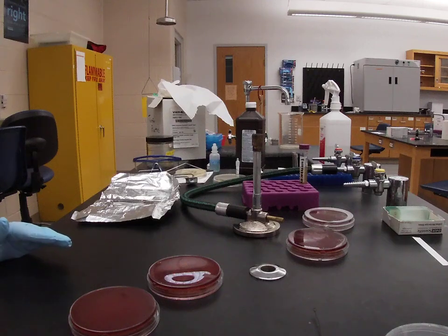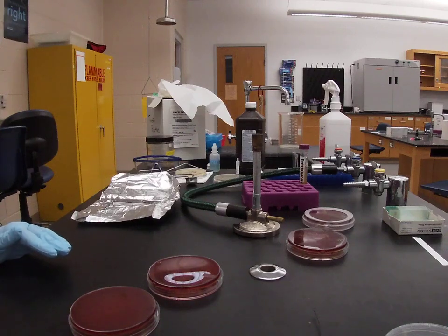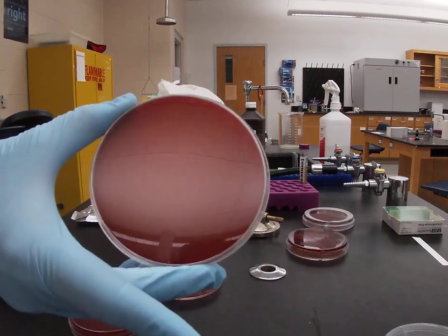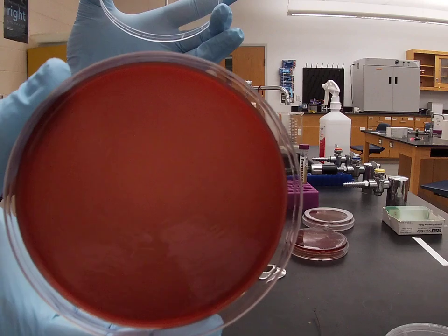Tryptic soy is a general purpose supportive medium that has lots of different nutrients in there that most things can grow on, but it's enriched with that 5% sheep's blood in order to make it a better environment for really fastidious organisms, like the streps. The streps grow really well on blood agar. So blood agar is an opaque red plate. It is very red and you cannot see through it under a normal basis.